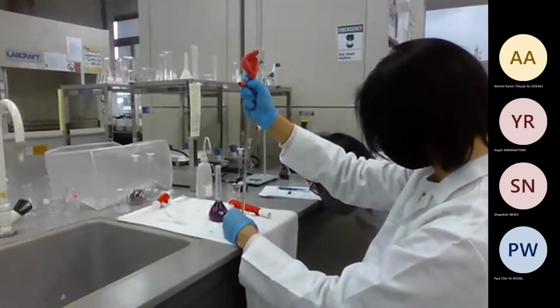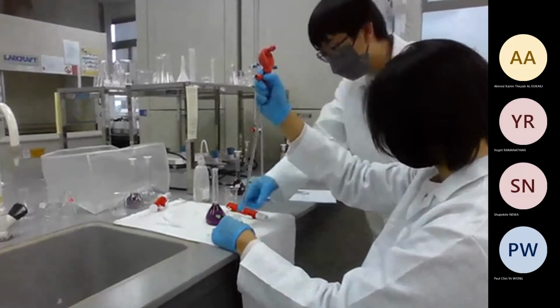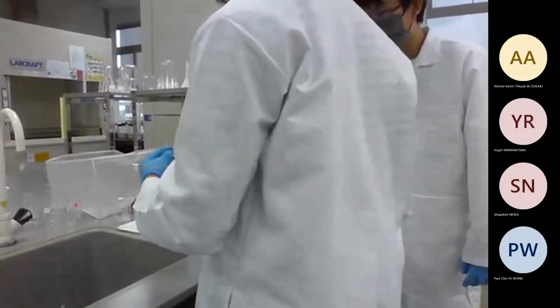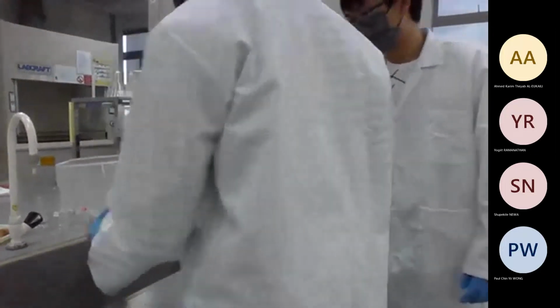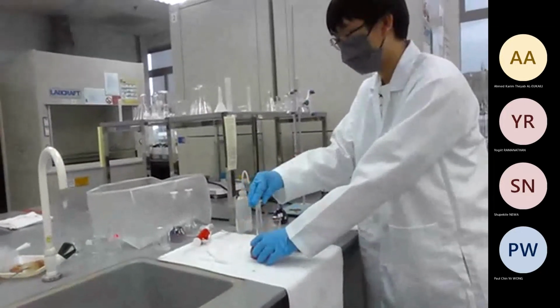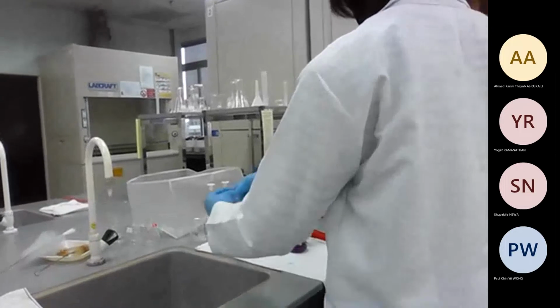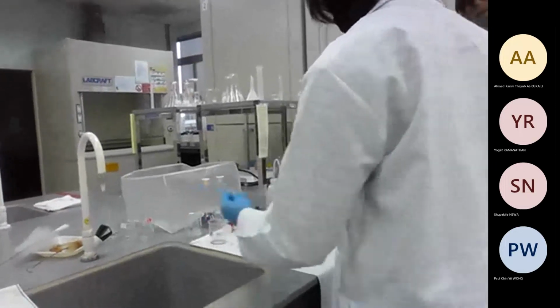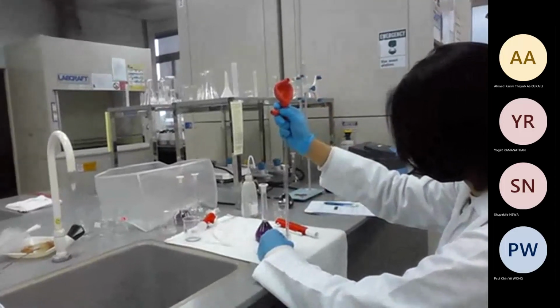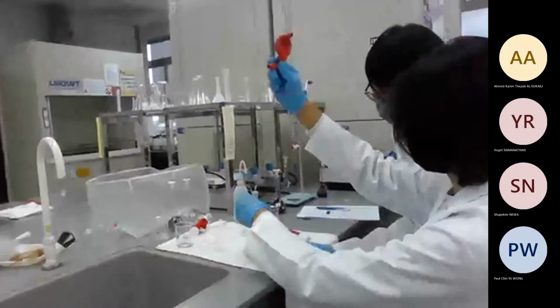Have you rinsed? So you don't want to rinse? Yeah, you don't. Okay, so just throw it. Not in the sink. Yeah, there. Keep one beaker here. No need to go every time there. Later you wash all the beakers. Not enough. Not enough. Don't invert.